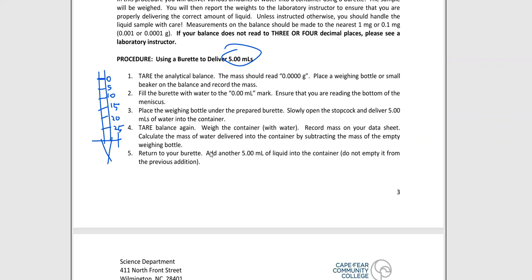I will say that when you get a burette, number 1, these things have been used by someone else, and number 2, they might not have a stopcock. So what's going to happen is that you might have to assemble the stopcock first, and if you do that, great, that's good practice. And then we are using water in this part. So I would like for you to add a little bit of water in here, and I would like for you to rinse the burette with that water.